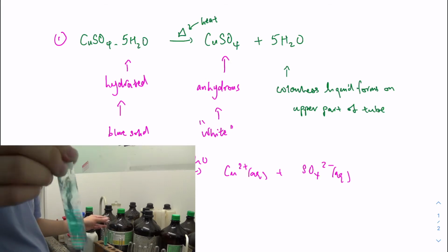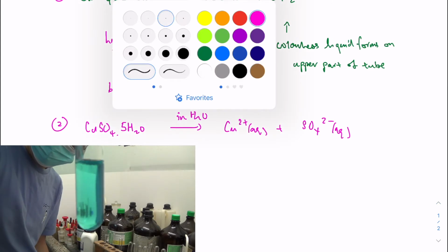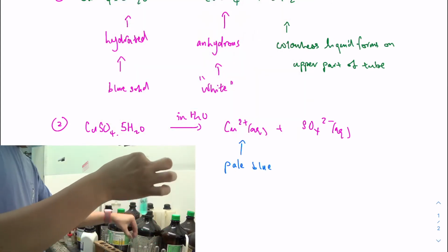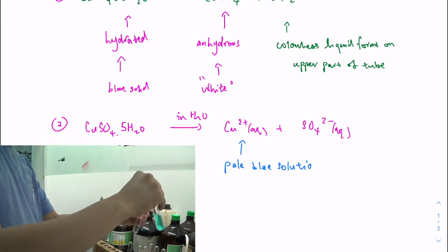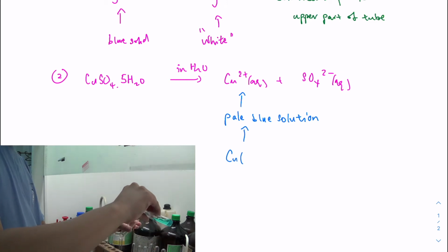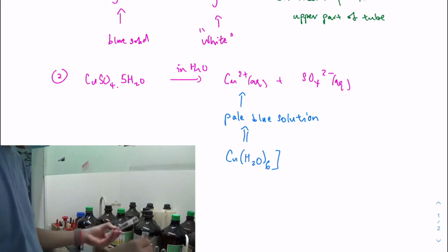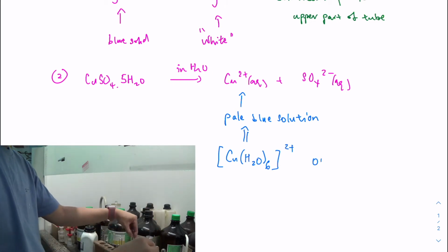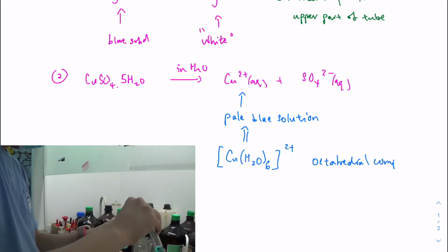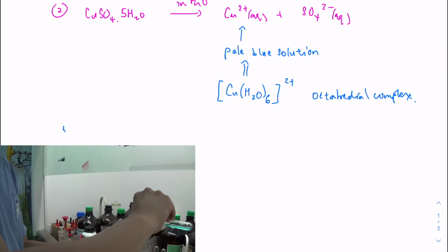Oh yeah, this one is fine. So you can see that most of them kind of dissolve in solution already. So this is a pale blue solution. What I'm going to do is split it into a couple of portions. The first of which I can test with sodium hydroxide, I could test with aqueous ammonia, and then I could also test with the addition of chloride.